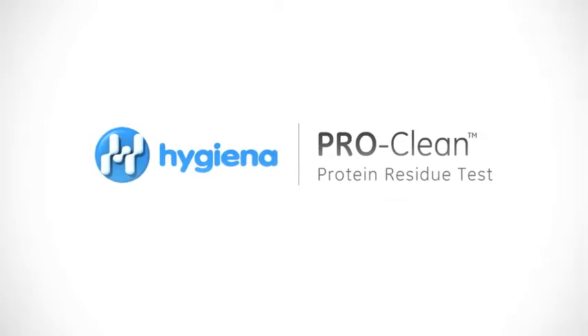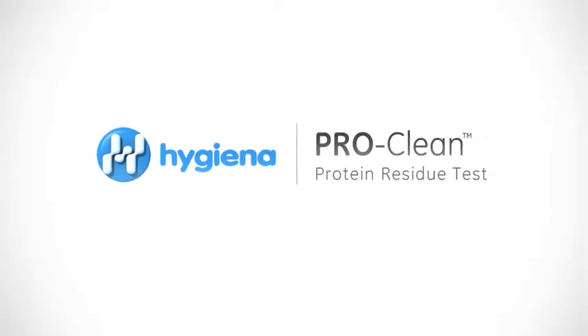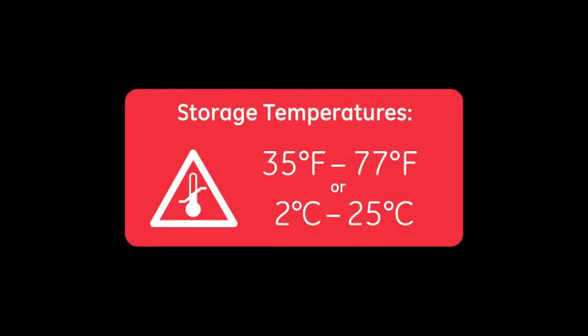This instructional video will demonstrate the proper use of Hygiena's ProClean Protein Residue Detection Test. If ProClean is kept in cold storage, let the test acclimate to room temperature before testing begins.